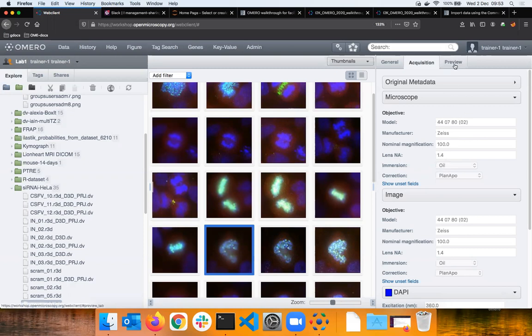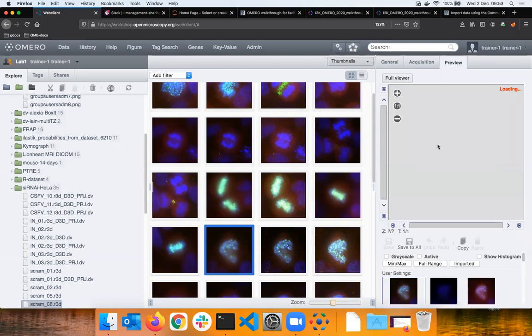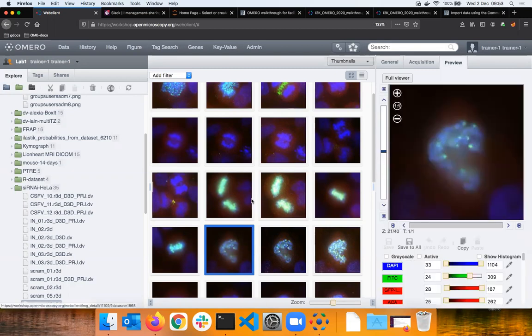Further, we have a preview tab on the right-hand side where you can do first inspections. So just after import, which we just described in full, with the metadata, the typical scientist would attempt to view the images, and for that he or she has to change the rendering settings. This is the manipulation of the slot of intensities which will be displayed on the screen. Okay, we call that rendering settings, and you can adjust it in the preview tab.